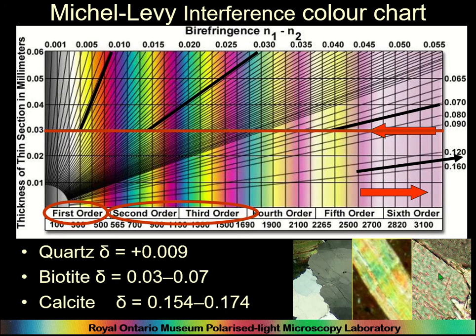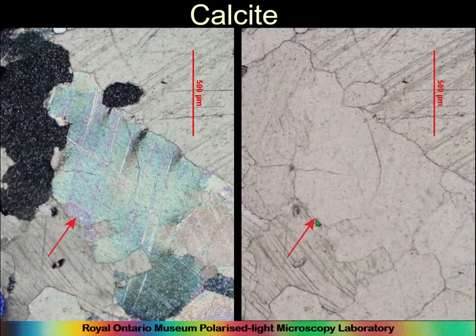Really quite insipid, actually. Here we have calcite. This looks like a marble or something, large intergrown crystals of calcite. Here we have cross-polarized light, and here we have plain polarized light. So here it's just a transparent colorless crystal, and here it's got its birefringence. And here you can see this has some colors.